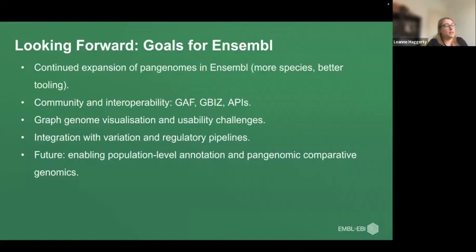And we're also tackling visualization head on. So we're developing intuitive ways to explore multi-assembly data. I touched on we've been working on a structural variant viewer. And we're also considering gene neighborhoods, how we would view those. So all of these are very exciting, but very difficult to implement because, as we've mentioned, the linear coordinate system is what we're very much used to, and comparing those and moving into a multi-coordinate system is something that blows our mind a little.